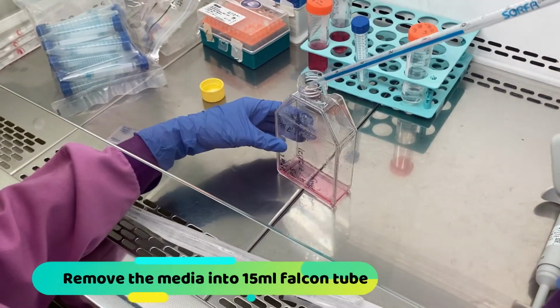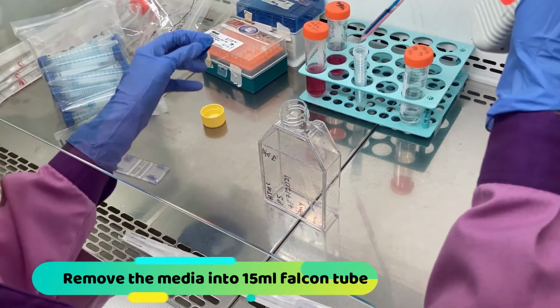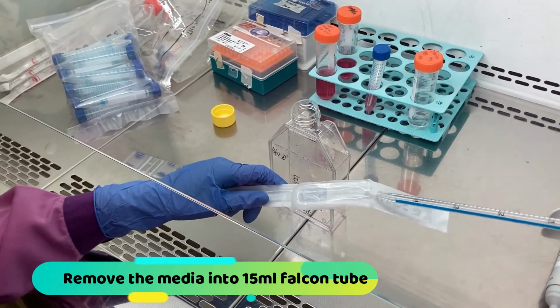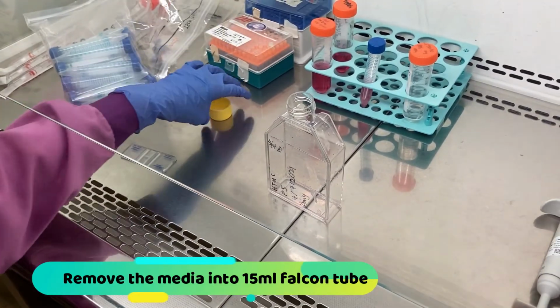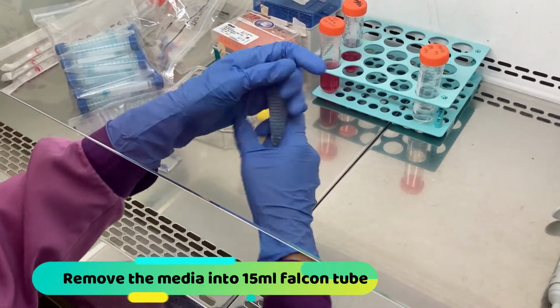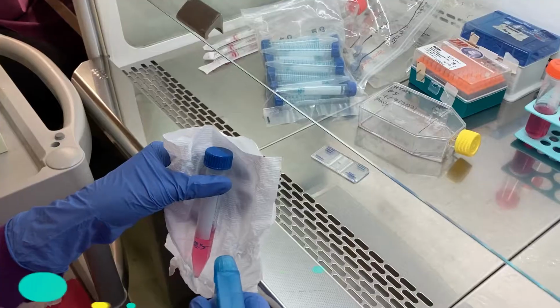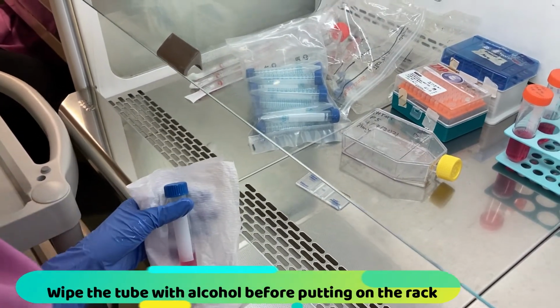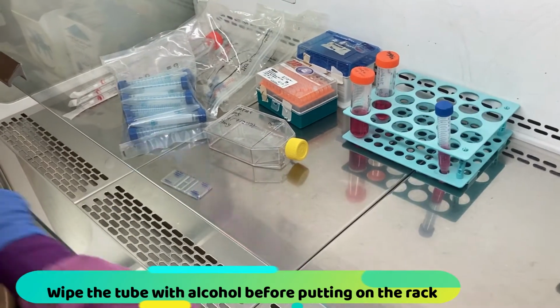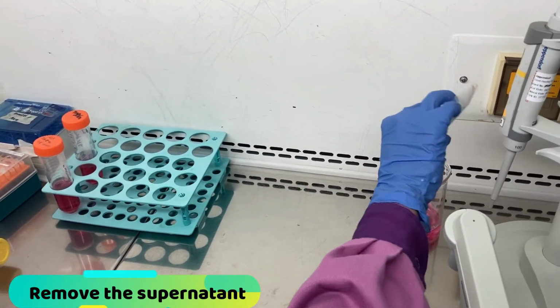Next is to remove the media into 15 ml Falcon tube. By this stage, we assume that all cells have detached from the surface in the flask. Centrifuge the tube to divide the pellet and the supernatant. Wipe the tube with alcohol before putting back to the rack. Next, remove the supernatant into the waste beaker.